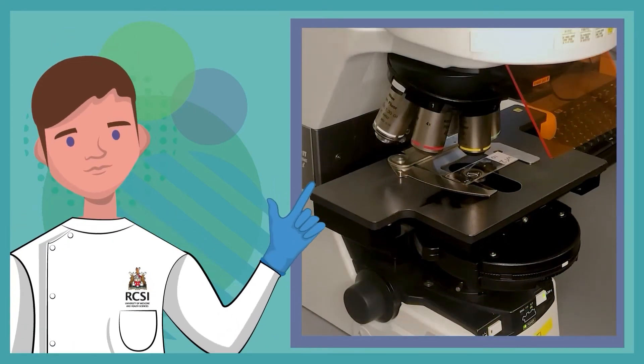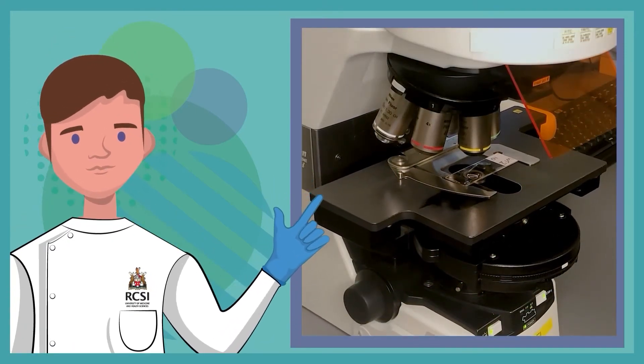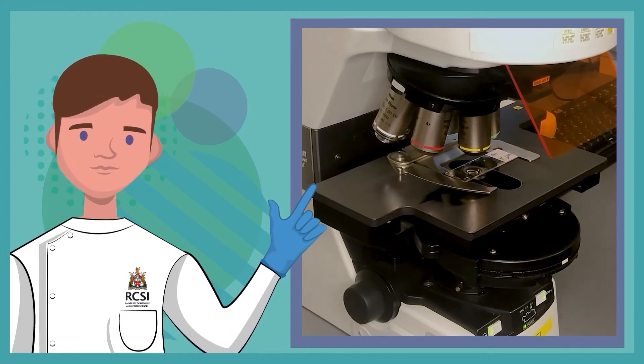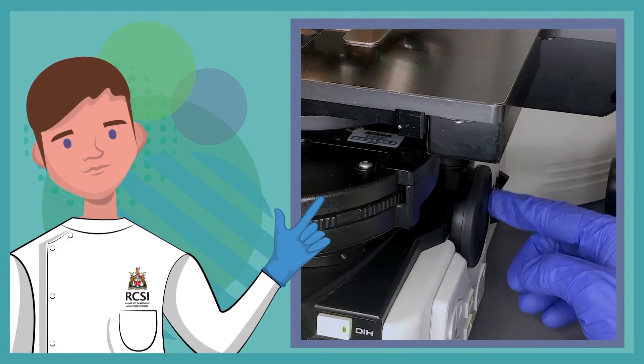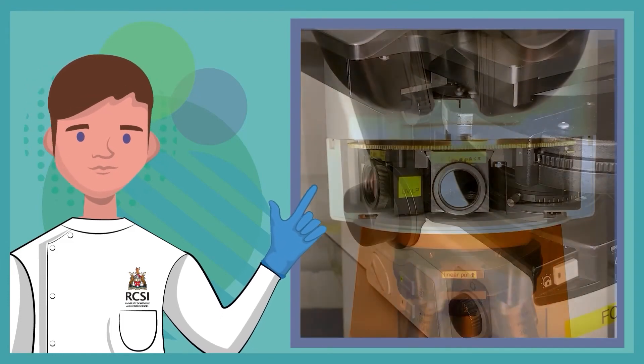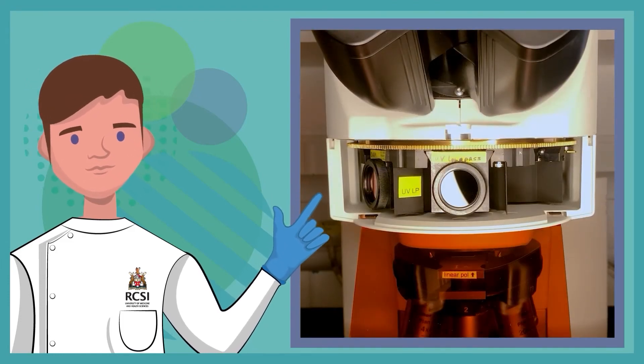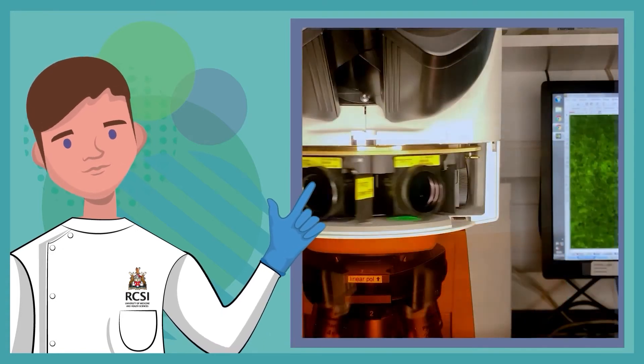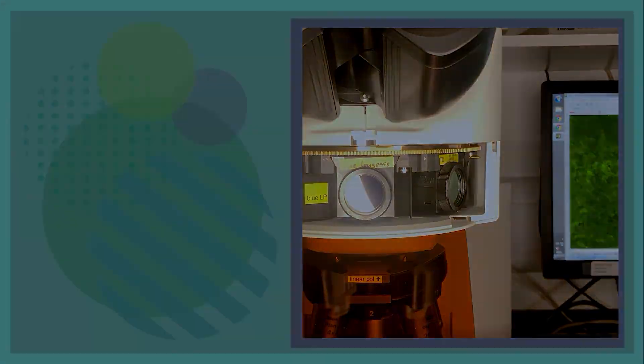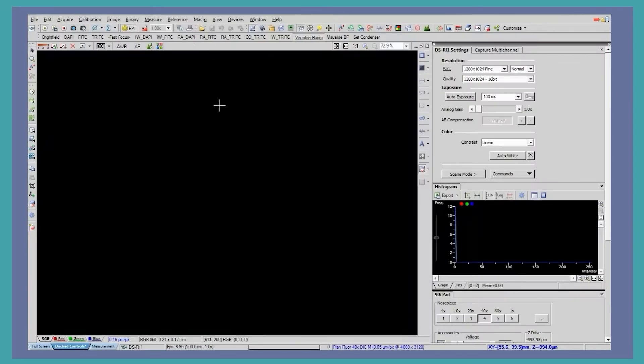While many microscopes are different, there are also many automatic features that can help bring your sample into auto focus. Additionally, you can do this manually through the coarse or fine focus knob. As we capture an image of different colors, the microscope will flick through different filters for each corresponding color. Once you've found a region of interest on your sample that you're happy to image, you can then focus on the computer interface, and this is an example of what it might look like.